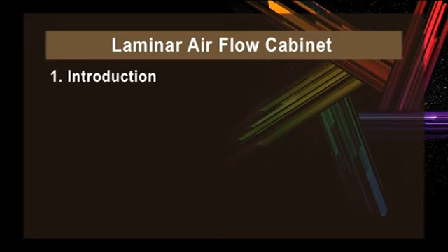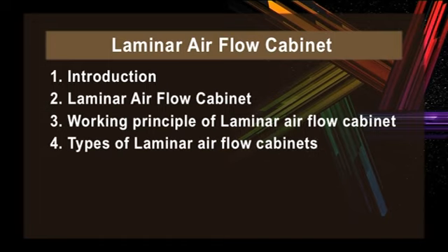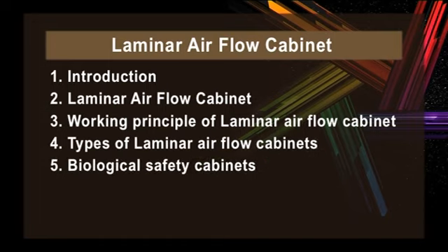Today, the topic laminar airflow cabinet shall be discussed under the following subheadings. 1. Introduction. 2. Laminar airflow cabinet. 3. Working principle of a laminar airflow cabinet. 4. Types of laminar airflow cabinets. And at last, 5th, biological safety cabinets.